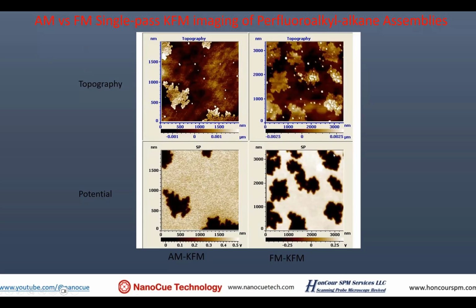The one on the right has much smoother imaging and lower noise, a much smaller detection limit. I actually have one more image I forgot to include, where I scanned the same sample halfway using the AM mode and halfway using the FM mode, with the exact same feature. This way you can see the comparison side by side. The FM is much more sensitive and much better.